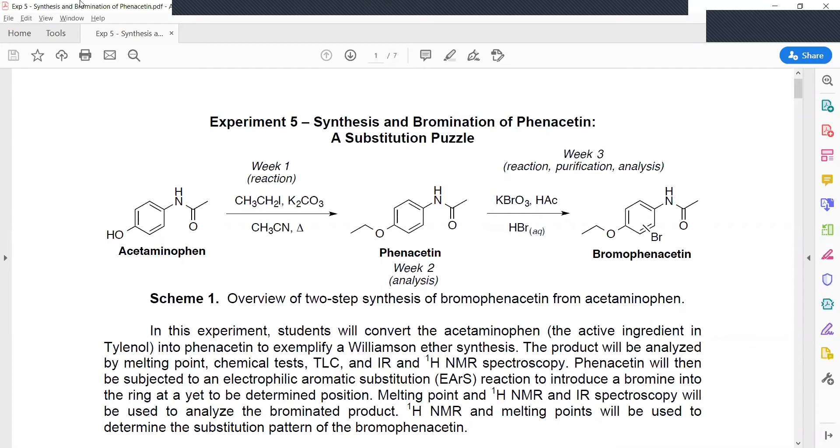Welcome to Organic Chemistry 110L. This is Experiment 5, Synthesis and Bromination of Phenacetin, a Substitution Puzzle. This week, we're going to be making Phenacetin from acetaminophen via a Williamson ether synthesis using ethyl iodide, potassium carbonate, and acetonitrile.